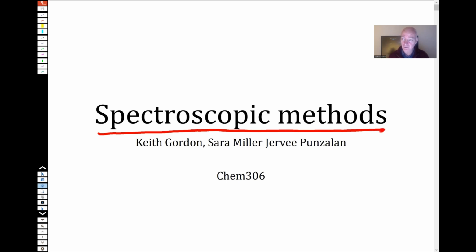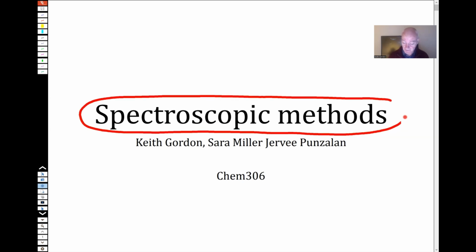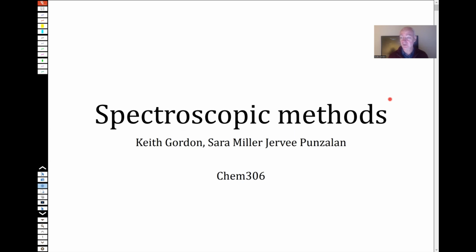But what I really want to focus on today is the actual nature of the spectroscopic methods and how they're different and how they actually create sort of a richness to the data that is quite useful, but also is really distinctive to those spectroscopic methods, and therefore it's useful for us to understand some aspects of that.